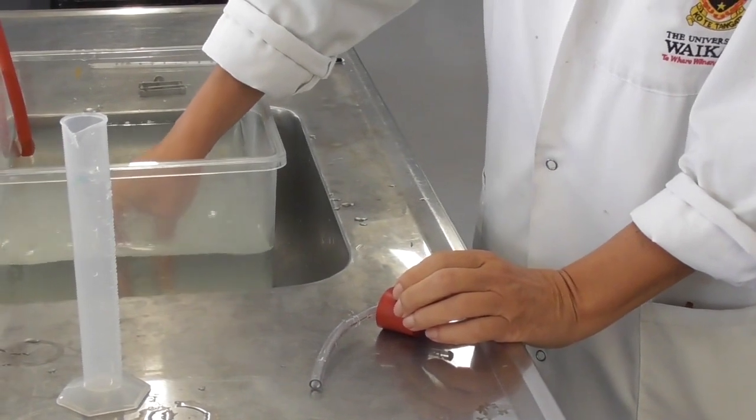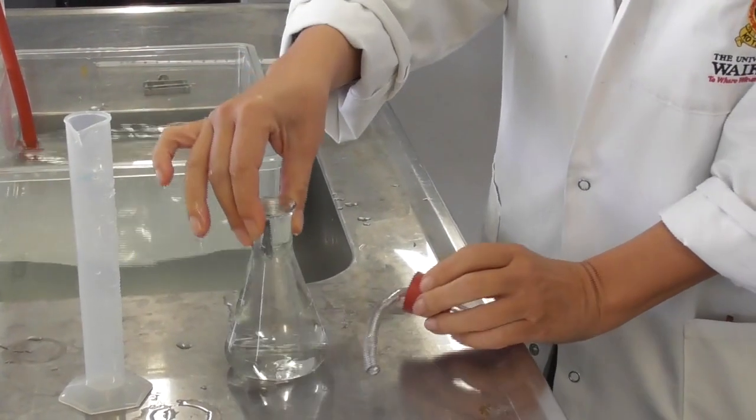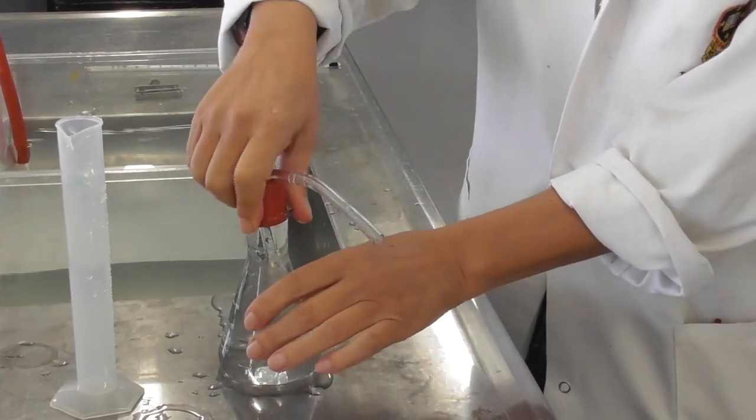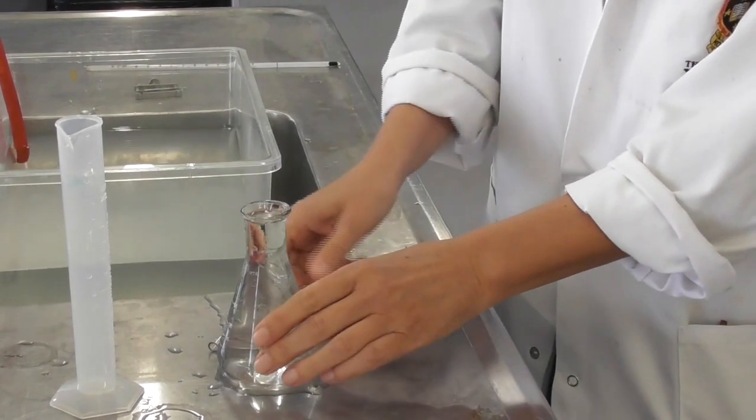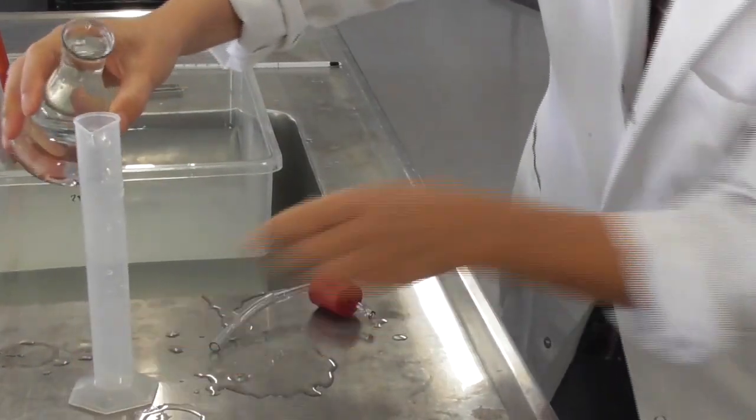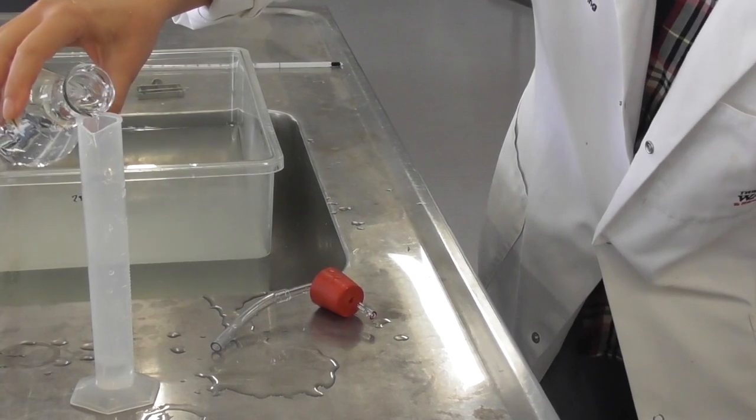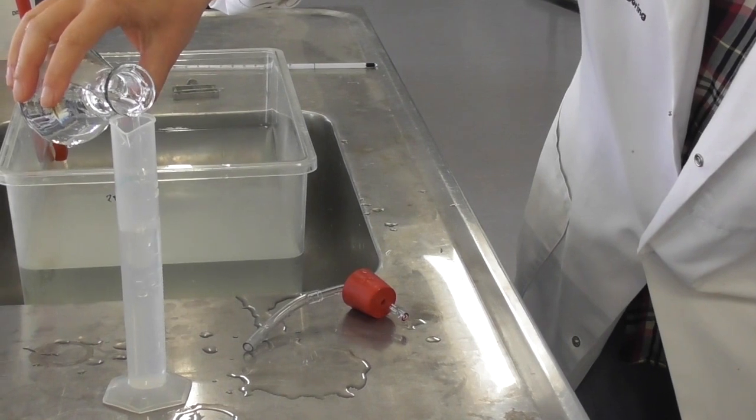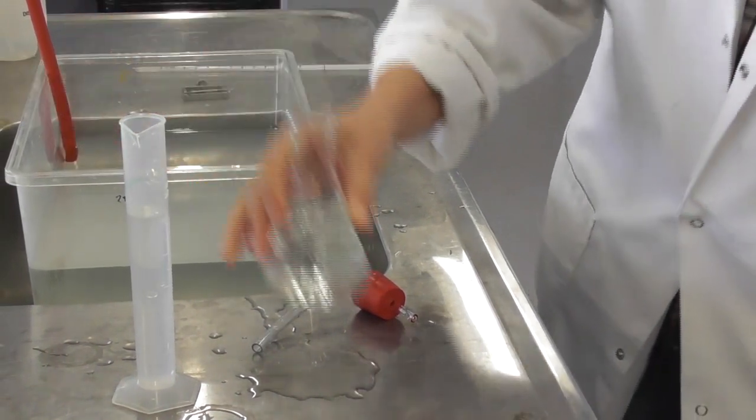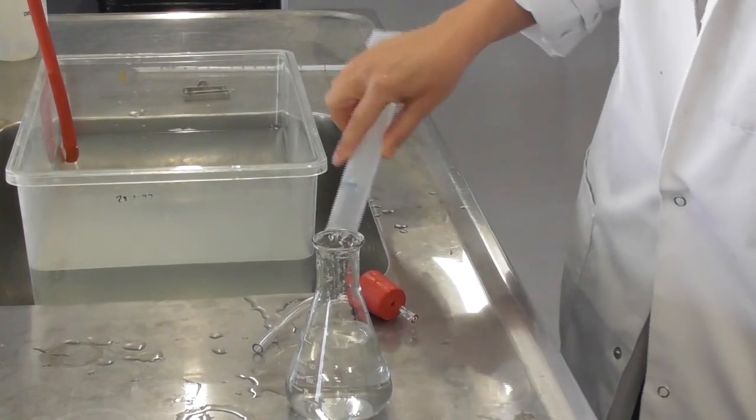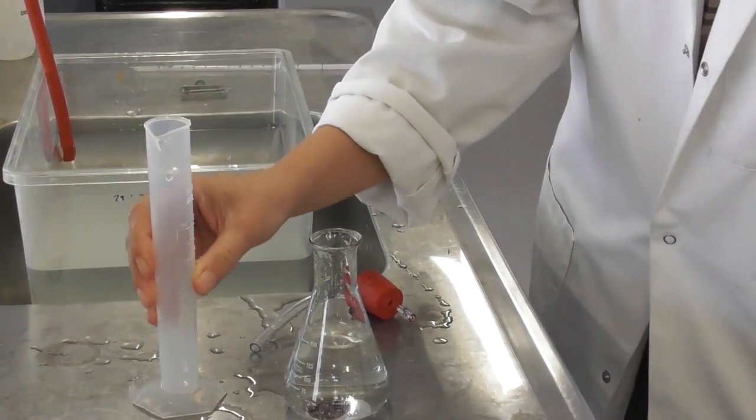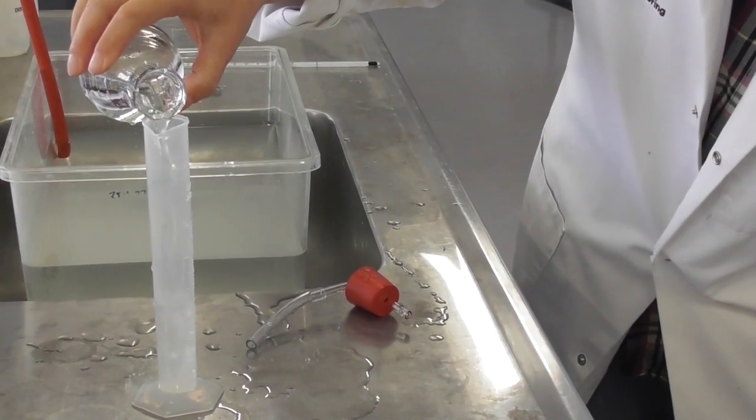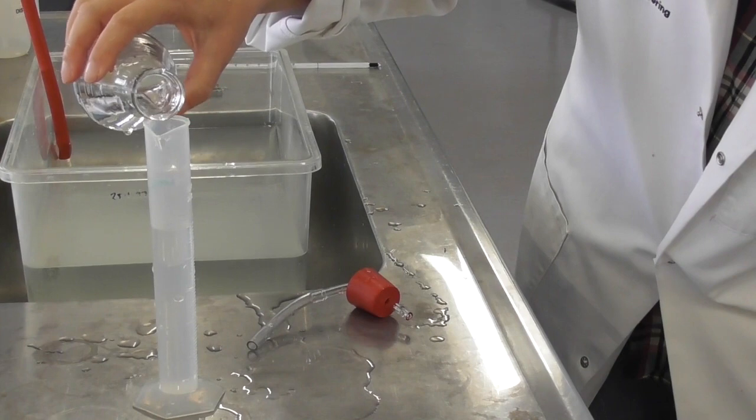To determine the overall volume of the flask we fill it to the top with water, attach the bung again, and take it out. Now we have the exact volume of the air inside the flask at the start of the experiment measured out in water. As it is more than 50 milliliters we have to fill our measuring cylinders a few times with the water from the flask.